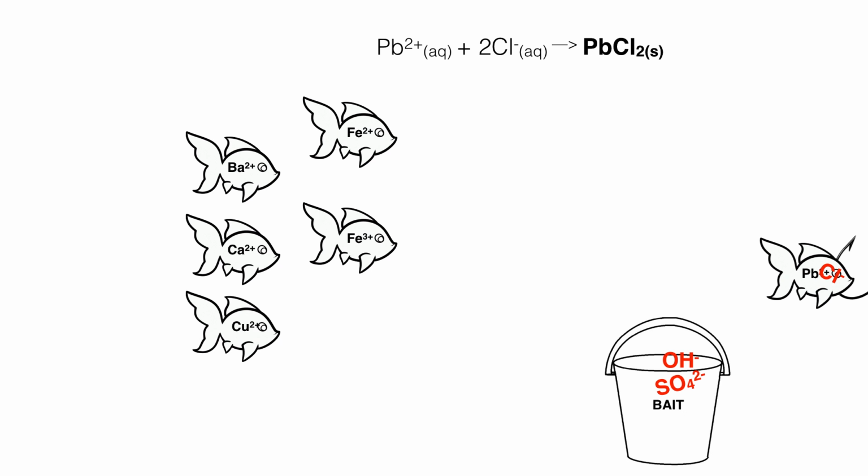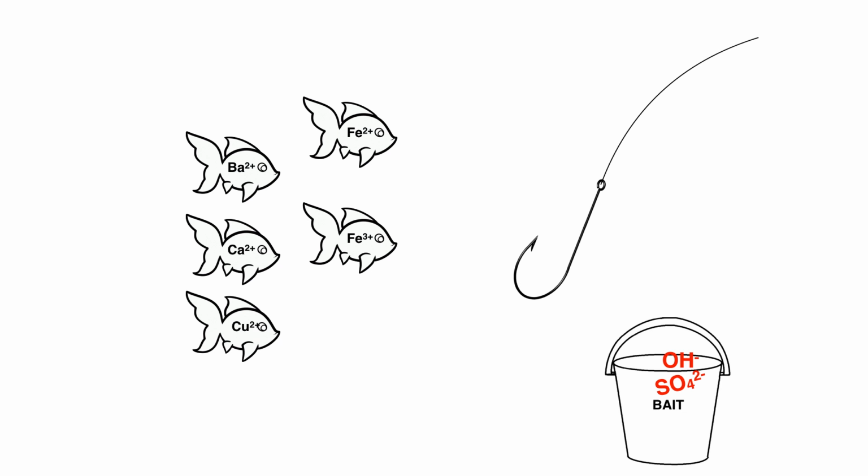Notice the S indicates the solid state, which of course is the precipitate. Having successfully removed lead as a possibility in solution, you can now say as a chemist, if you added chloride ions to a solution which potentially contained any one of these 6 ions, if you got a white precipitate, it would have to be lead chloride.